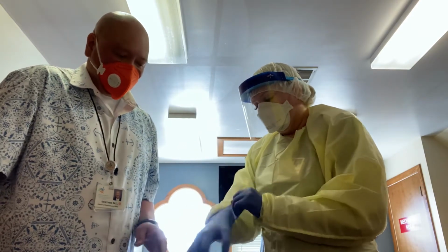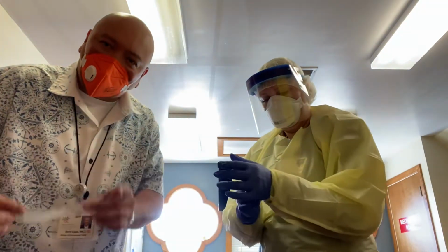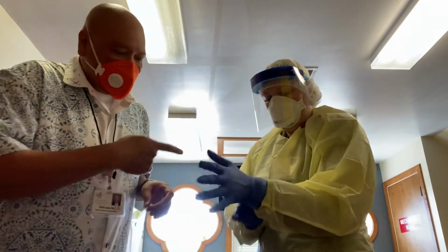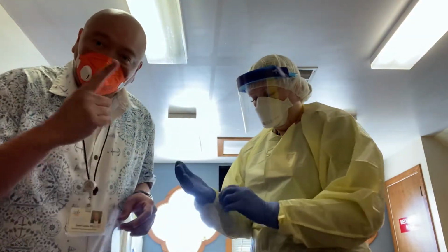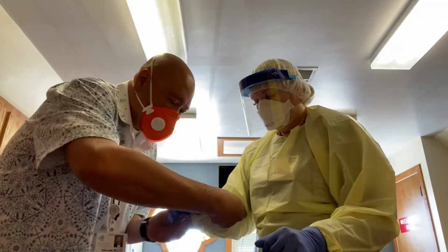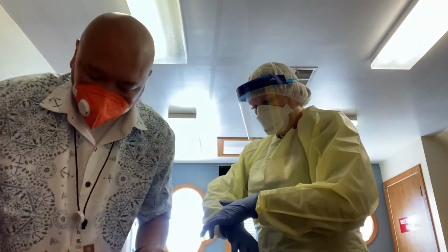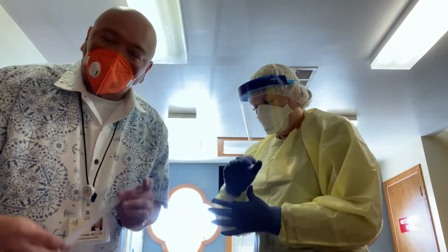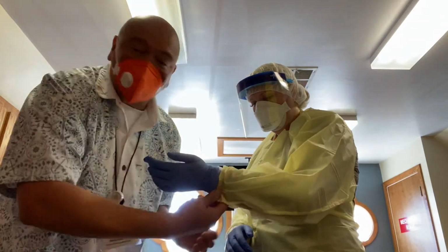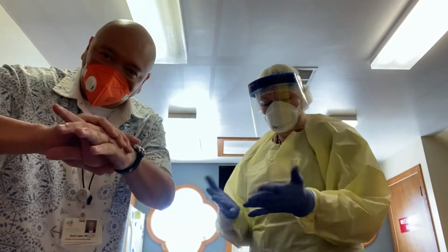Some of them don't have that thumb hole. Again, every equipment varies, so you need to practice before you go on site and do it. As you can see, she's tucking the gown inside the inner glove. Then you can put tape over the glove to make sure that the inner glove never gets out, rips, or gets removed in the process, so you don't get exposed. No exposure whatsoever. So put tape over it, make sure that it doesn't slip off.